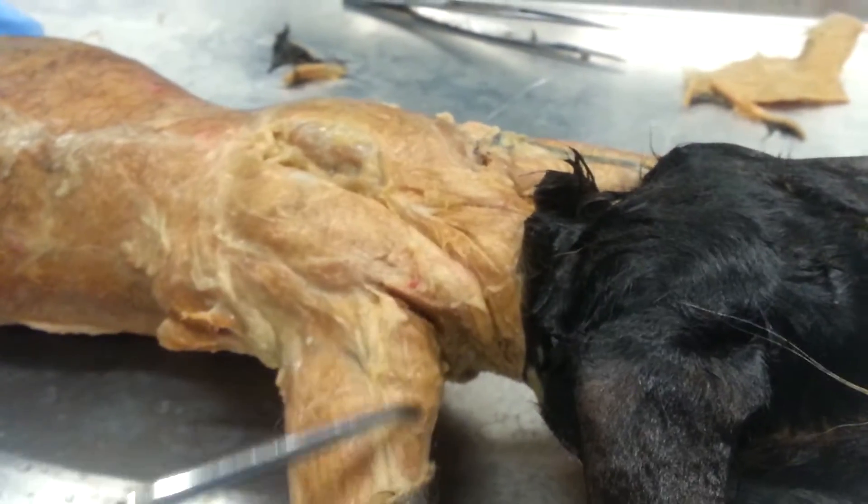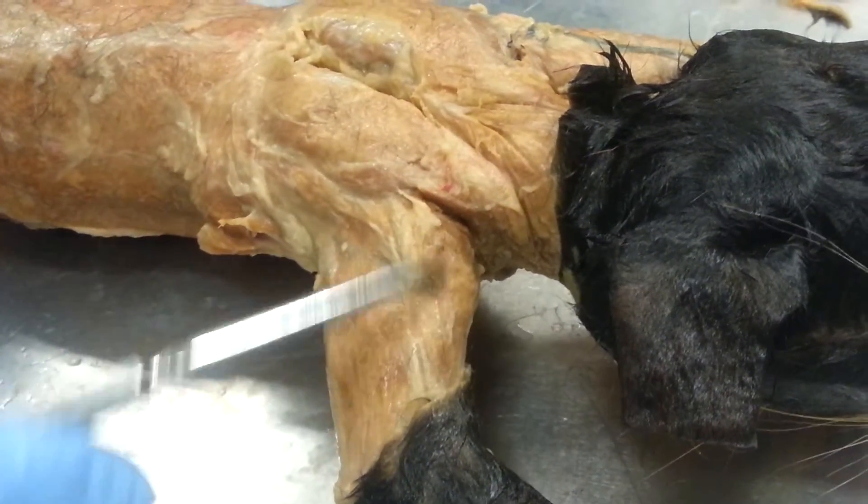So here is the clavodeltoid, which is also known as the clavobrachialis.